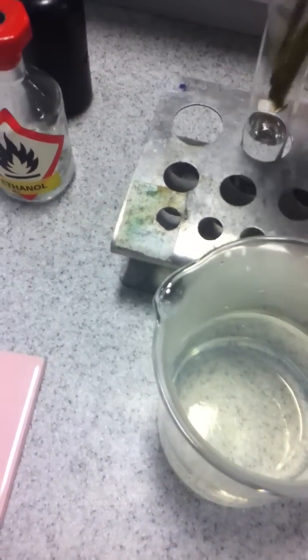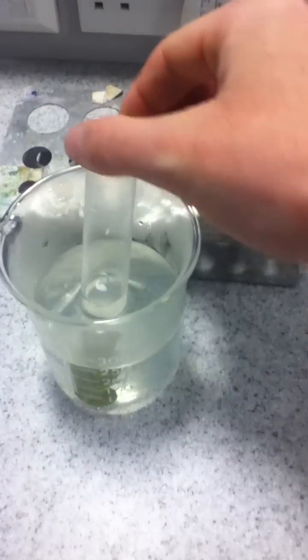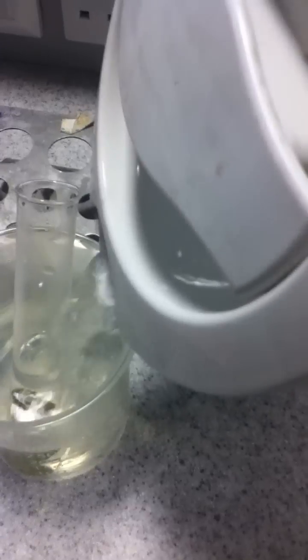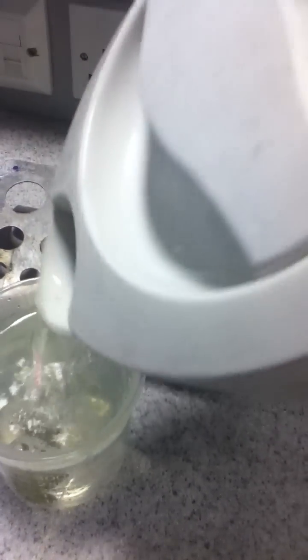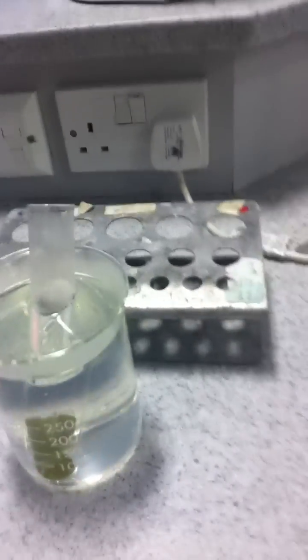We take the leaf out of the boiling water and put it into the boiling tube of ethanol. The boiling tube of ethanol then goes into the hot water, and you top that up with more freshly boiled water. Again, you're going to leave it for a bit.